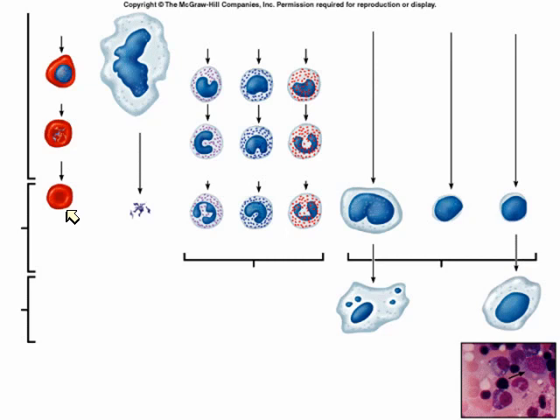What I've just put an arrow on, of course, would be the red blood cell known as an erythrocyte. Notice it does not have a nucleus. It has one earlier in its development in the bone marrow, but it loses it before it gets out into the bloodstream. The second, this is showing the platelets. Platelets are cytoplasmic fragments of cells that get out in the bloodstream. In lecture, you'll learn what they do. So on various slides today, we'll see platelets as we look at the blood.